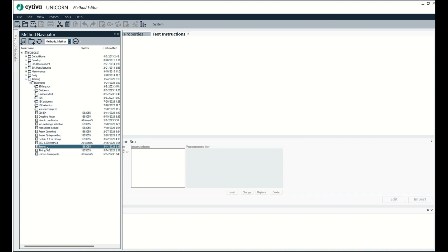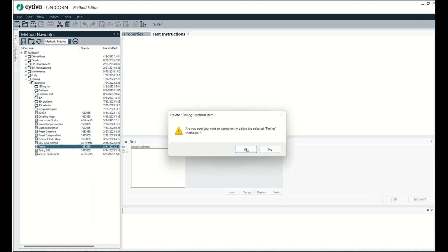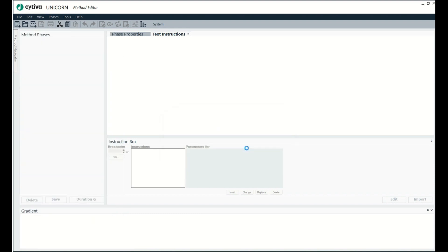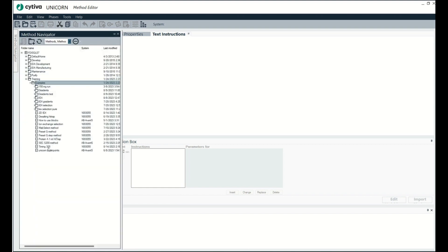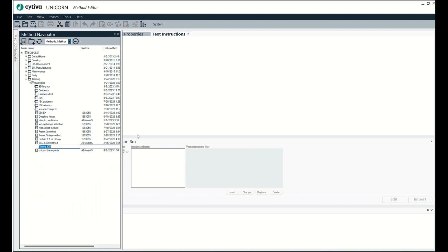And then I am going over here and I will just change the name of this file. I'll just call it timing. Okay.